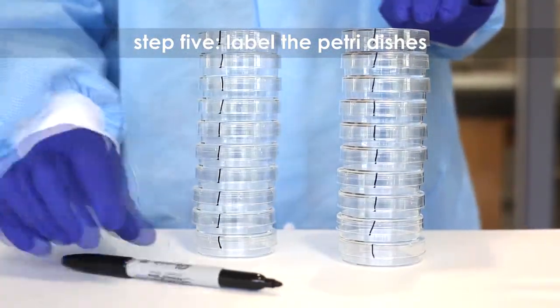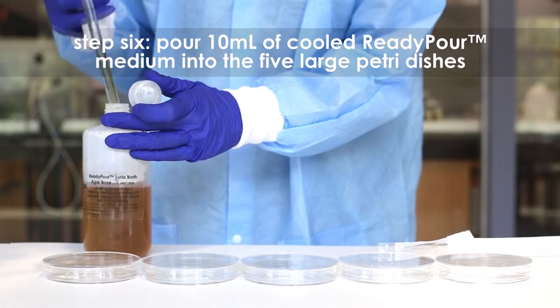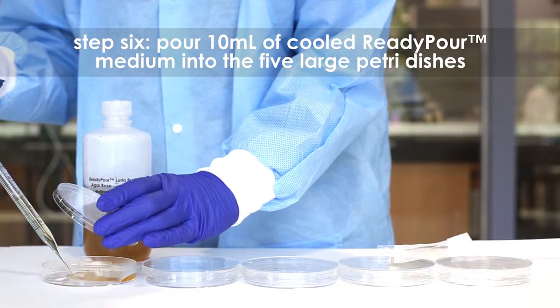Step 6: Pour 10 ml of the cooled ready pour medium into each of the five large petri dishes using a sterile 10 ml pipette and pipette pump.